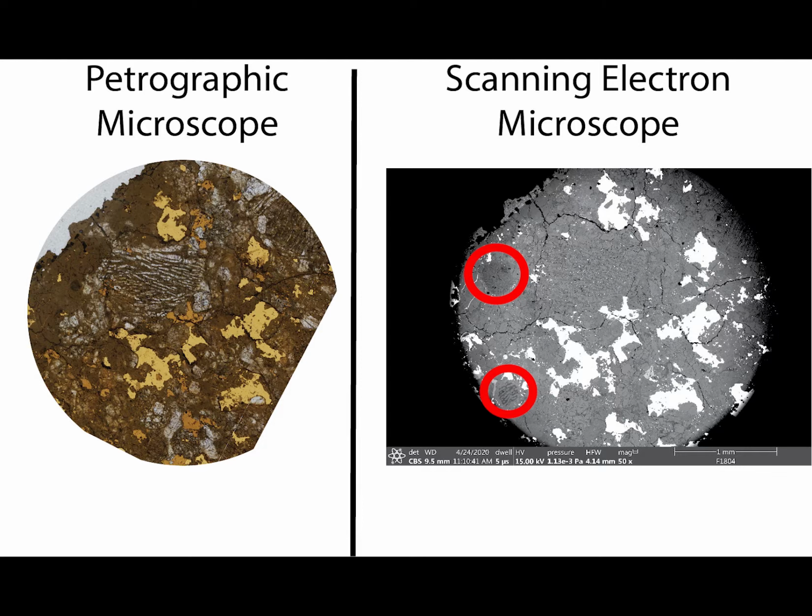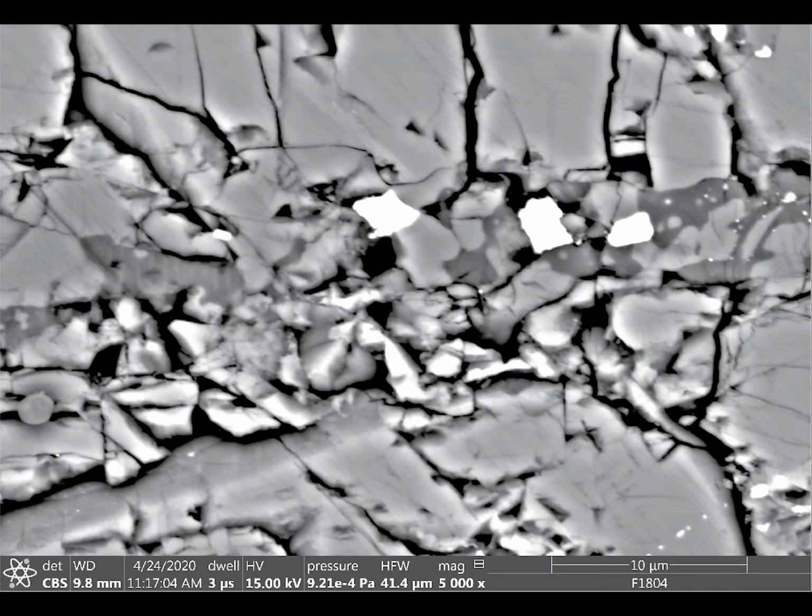Now, you can't see this in the image here, but right here, in the center of this bullseye, there are 3 really bright grains. So let's zoom in here. This is now at 5,000x magnification. And you can see we have a nice, crisp image showing these 3 bright grains within the darker matrix. Now, SEMs can be pushed further, maxing out at about 100,000 to 300,000 times magnification, while still maintaining a high resolution, which basically means just that the image still looks good.